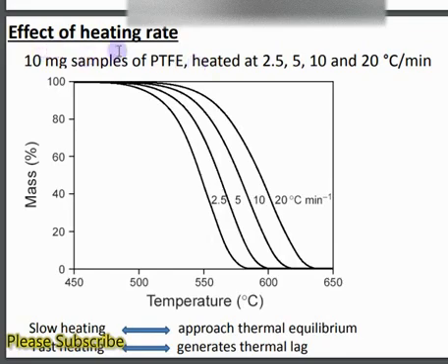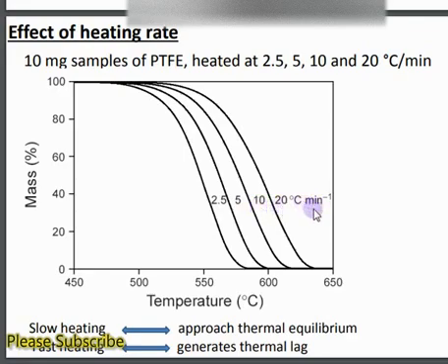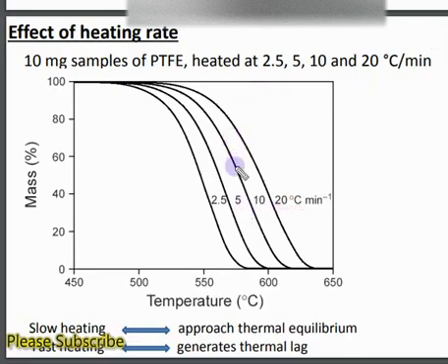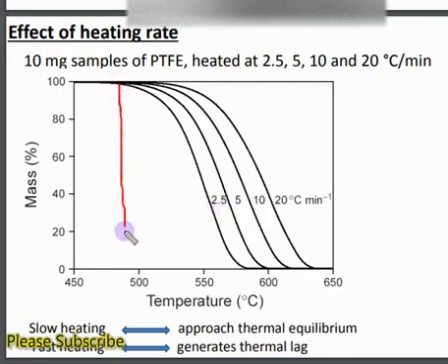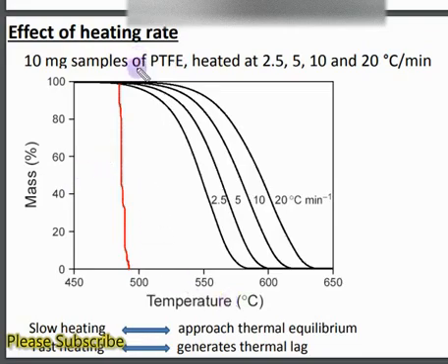Now we will see the effect of heating rate. By changing the heating rate — here we have 2.5, 5, 10, and 20°C per minute — increasing the heating rate generates a thermal lag. For instance, in the curve with a heating rate of 2.5°C per minute, the thermal event occurs at about 490°C.